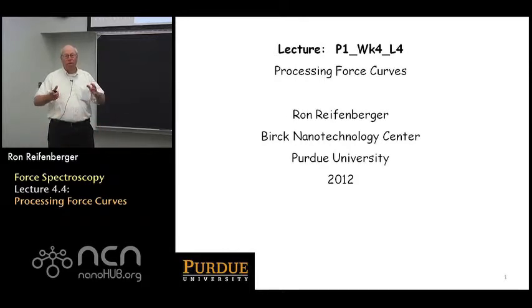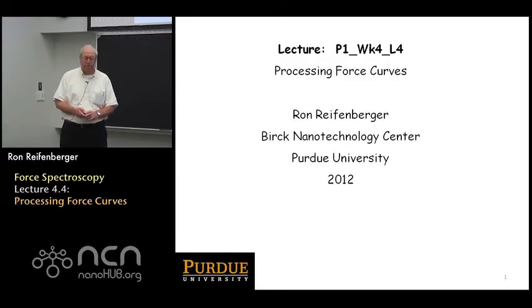This lecture is really intended to walk you through a number of very simple examples. Basically, the issue is once your AFM has acquired a force versus z-displacement curve, what do you do next? How do you process that information?